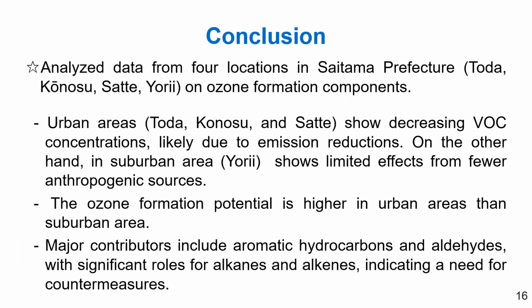To summarize the above, a case study of VOC observation using the Canister GC method was presented. This method has been applied to the analysis of a wide range of VOCs other than aldehydes, ketones, and low boiling point VOCs. This case study examines data obtained from observations at four locations in Saitama Prefecture, Toda, Konosu, Sate, and Yori, to analyze the dynamics of components contributing to ozone formation.